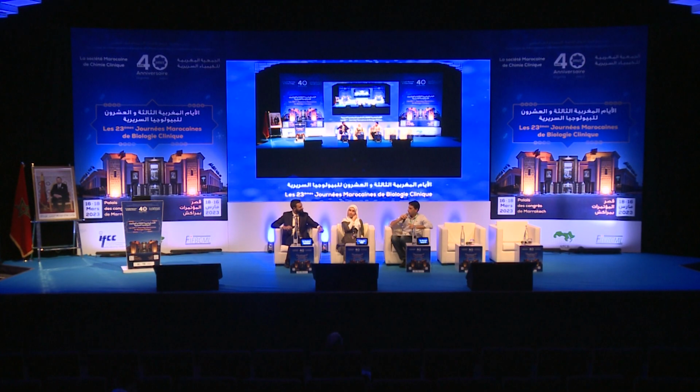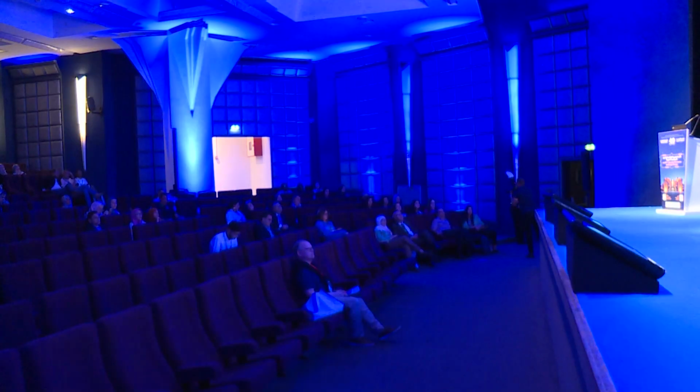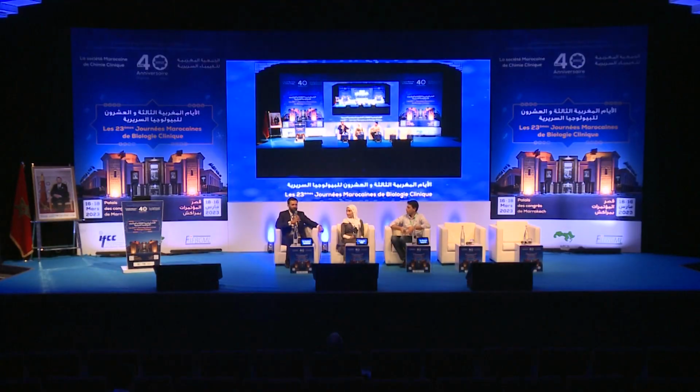Sure. I have a question also for you. Thank you for your presentation. My question is: is there any place for double centrifugation, and especially for some serology parameters? Is there any place for that? Yeah, thank you so much for your question.